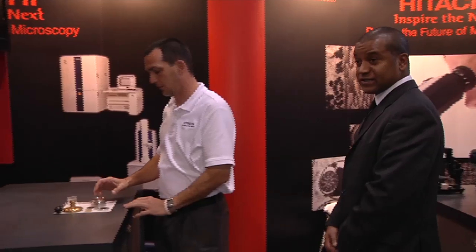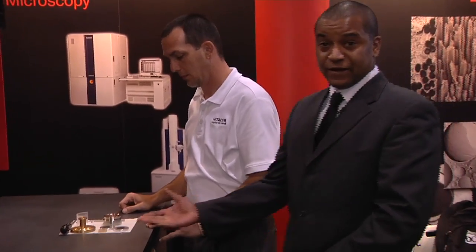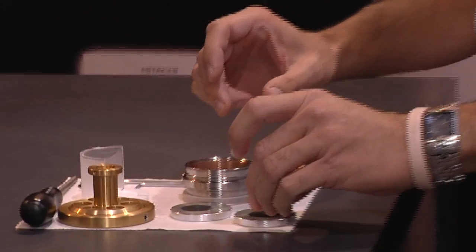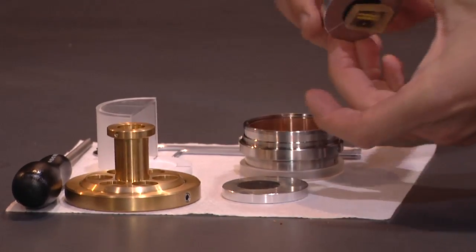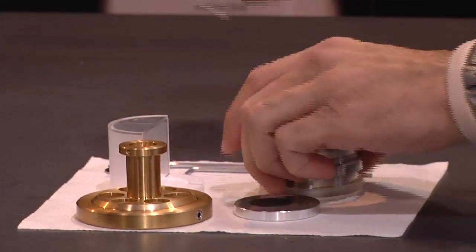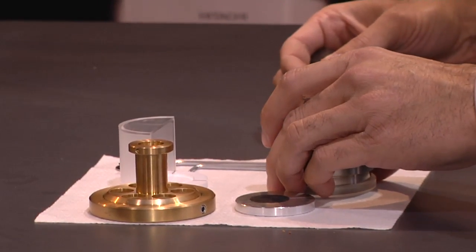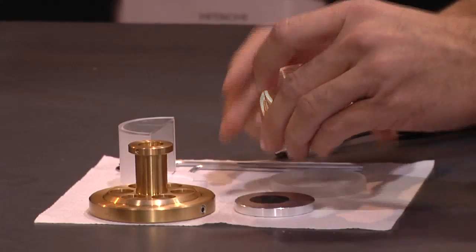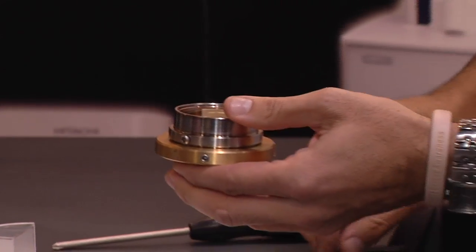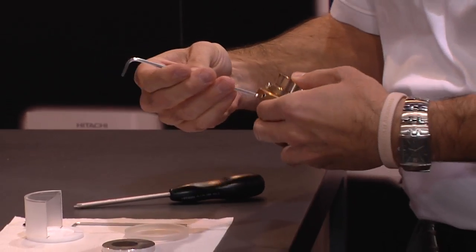It's very simple for us to set up samples, as we have here for our flat milling. You can take mounted samples, attach that to one of our stubs that is compatible with all of our scanning electron microscopes, and assemble that to the jig assembly. Once we target the sample onto the stub itself, we can place our area of interest towards the center of that stub.